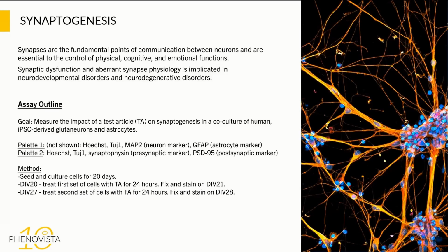So a lot of people are interested in understanding how their test article might be able to restore synaptogenesis or increase it, or if they're just curious overall on if their test article has some sort of detrimental effect on the health of the neurons through measuring a number of synapses.